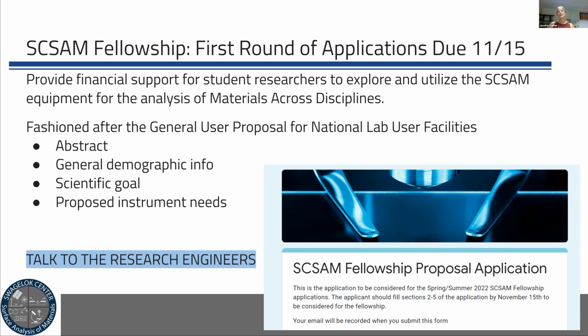and are in the process of selling off 6 more in hopes that we bring on new XRD capabilities to support the thin film researchers we have on campus, because our techniques and our tools are incompatible with those users' space. And because we've had a whole new team of researchers come in, both Jeff and John started at the beginning and middle of a pandemic, and we have new tools. We'd really like to get out there and meet the new student users because we haven't really engaged much with the community in the last 20 months or more because there was a pandemic.